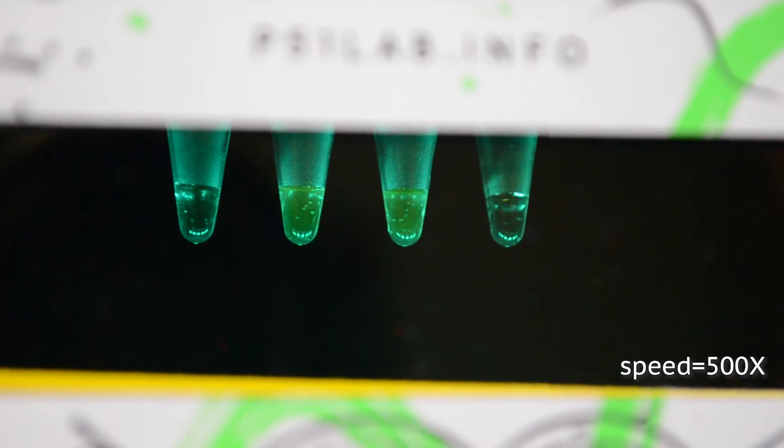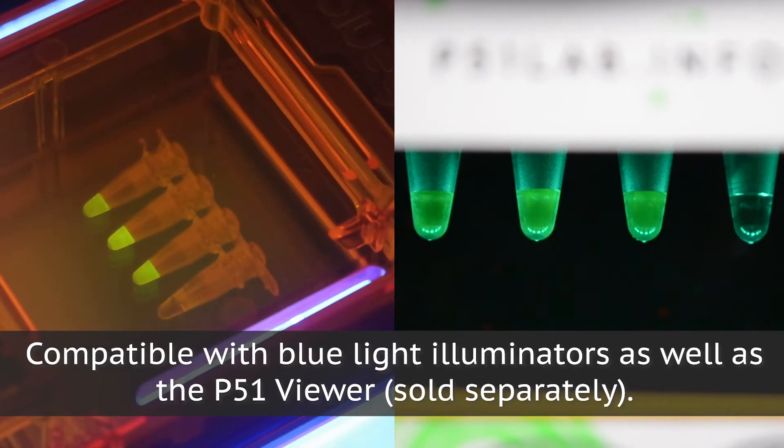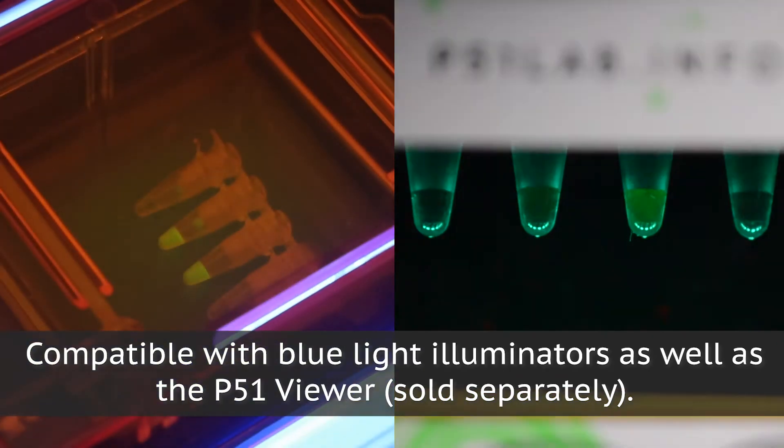As the two strands anneal and become double-stranded, the fluorescence will return. This lab is compatible with blue light illuminators as well as the P51 viewer. Using this simple assay, students can investigate how different factors, such as temperature and pH, will affect DNA structure.